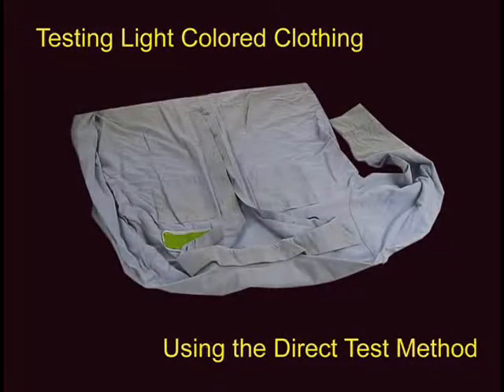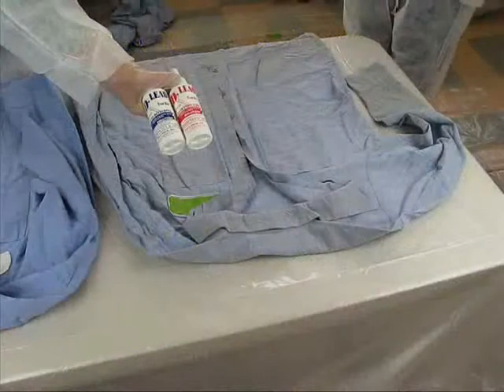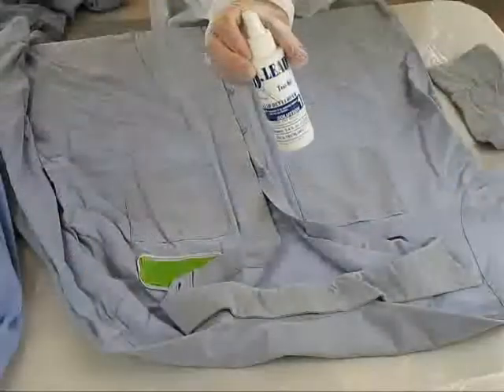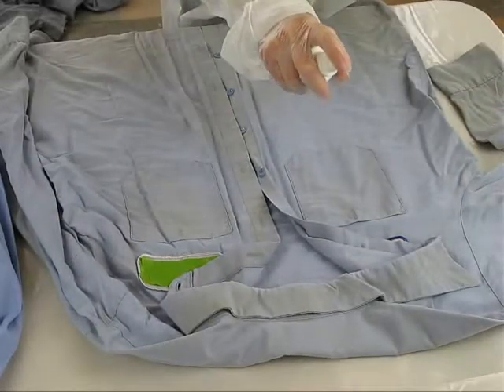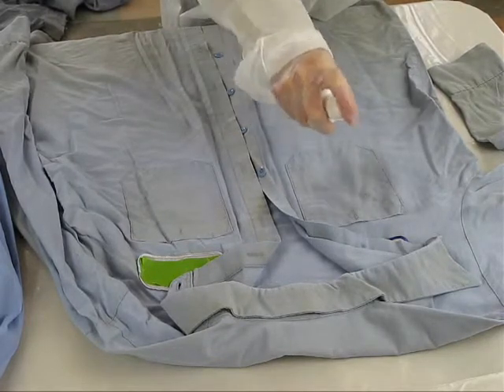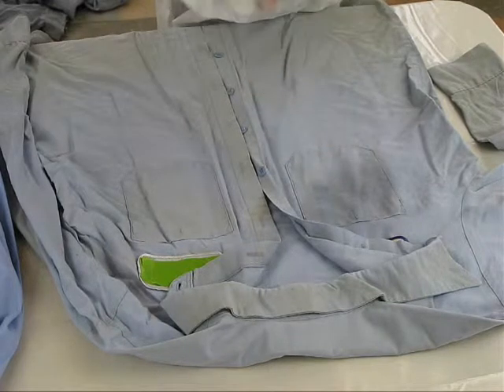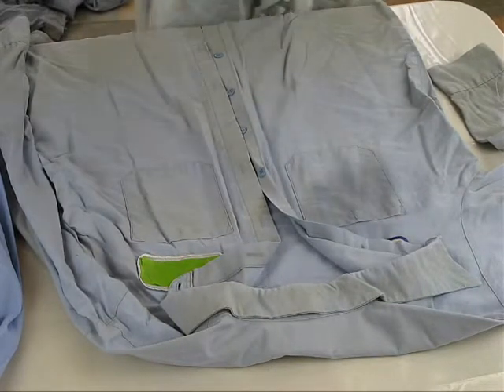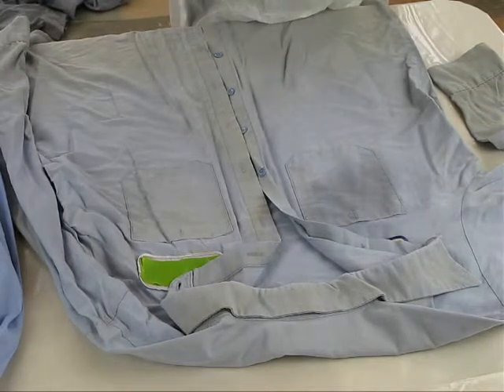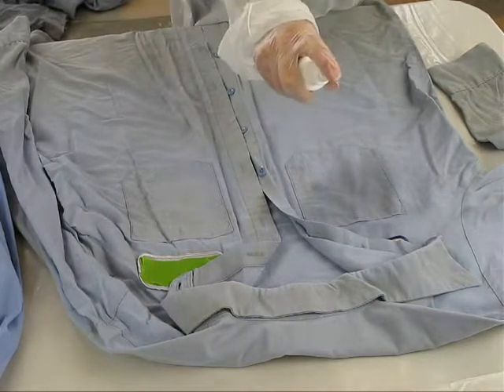Light colored clothing and towels may be tested using the direct test method. Spray bottles of both D-Lead Test Solutions 1 and 2 are used. We have selected the shirt pocket area to be tested. Use Test Solution 1 to spray a small area 8 to 10 times until the fabric is thoroughly moistened. Then spray the same area with Solution 2 about 8 to 10 times. If lead is present, a yellow color will appear.